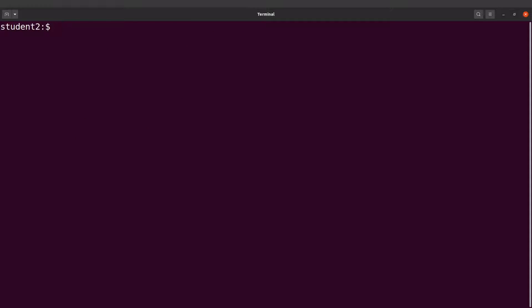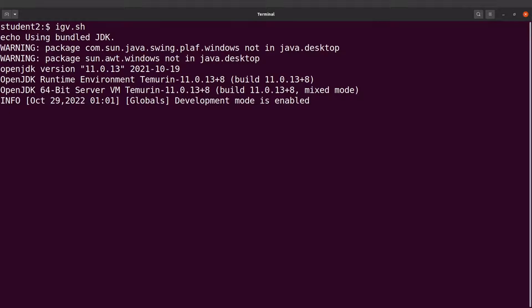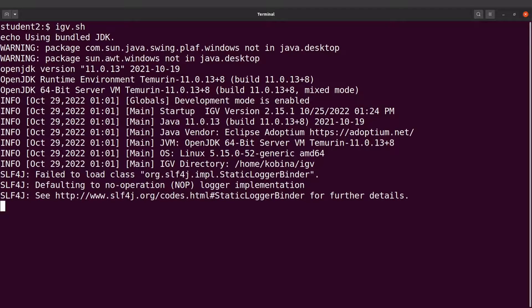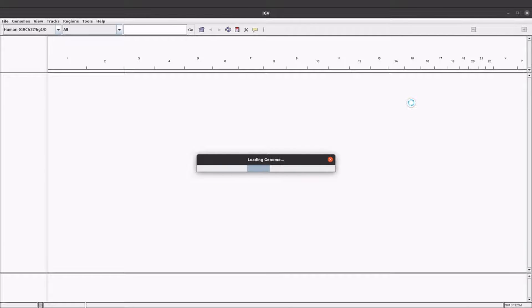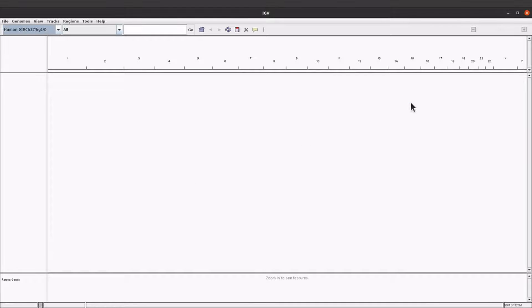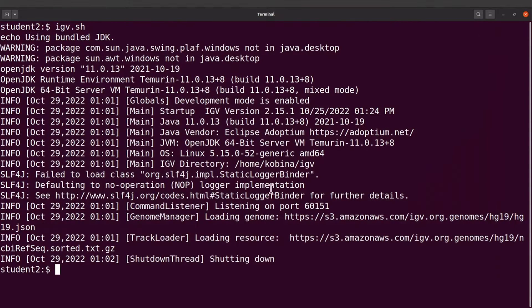In the new terminal I'll just type igv.sh and run it. If everything is configured correctly, IGV will open — and it does. Now whenever you open a new terminal you can call IGV simply by typing igv.sh, without needing to specify the full path. The PATH configuration is complete.